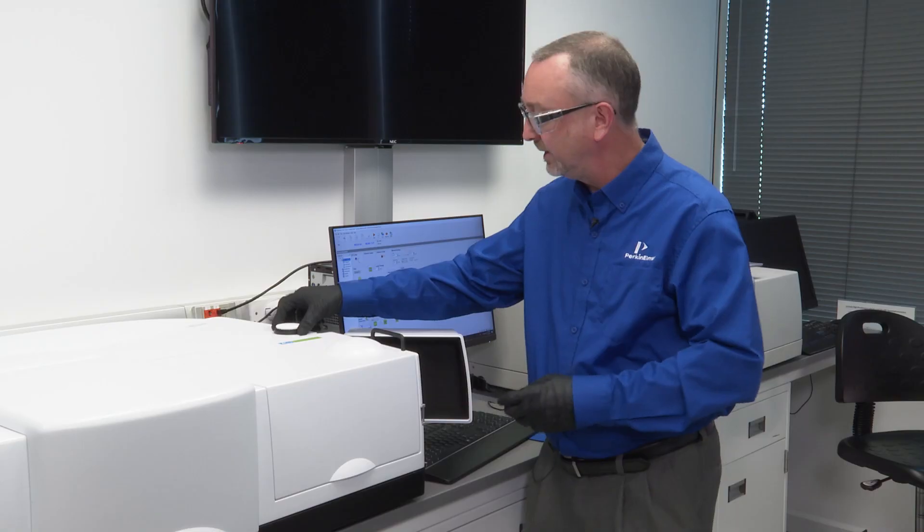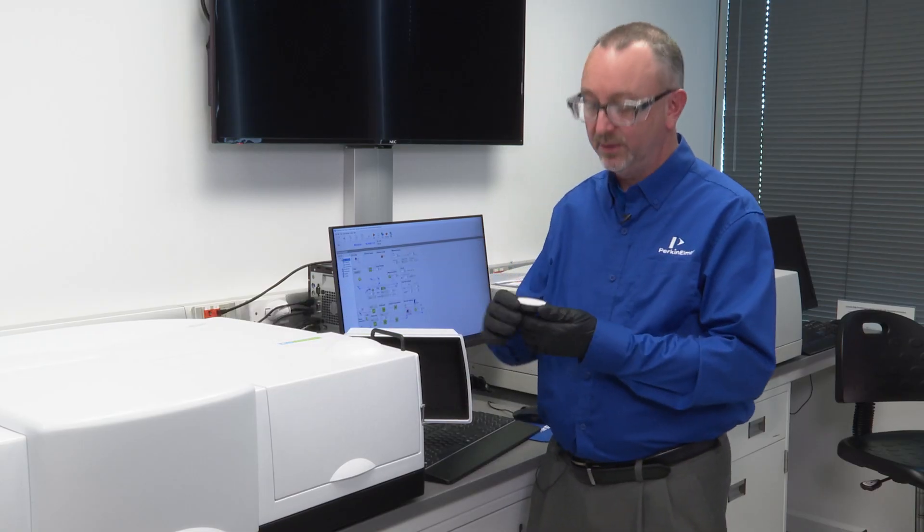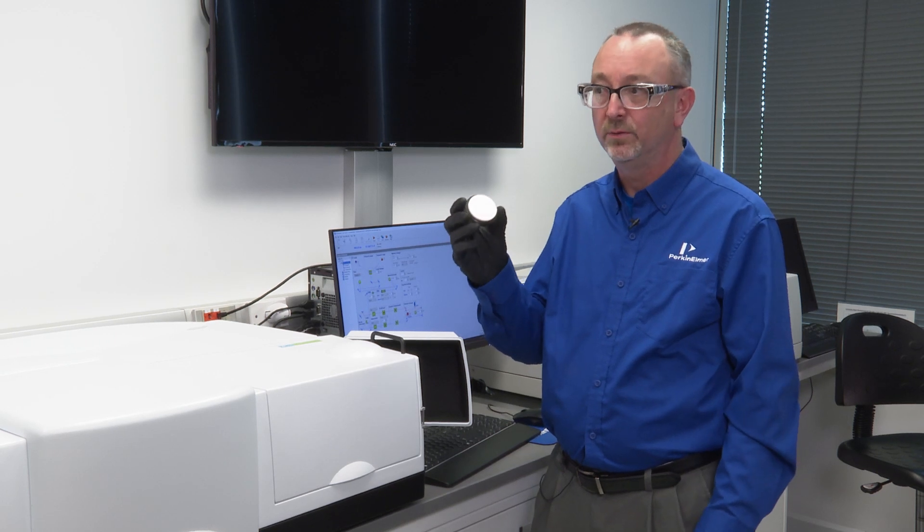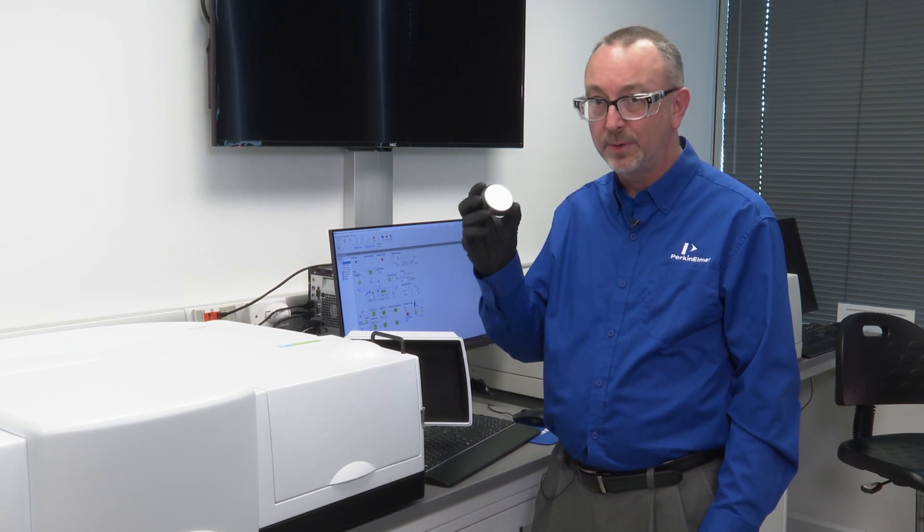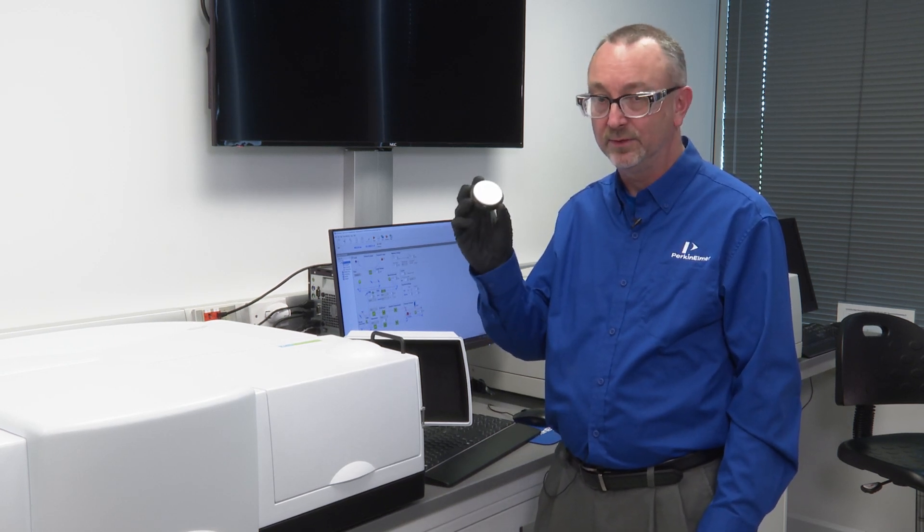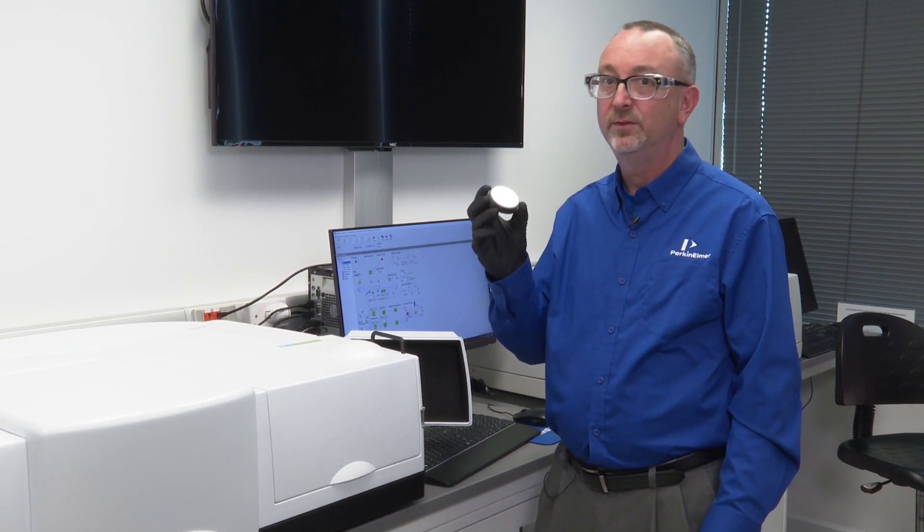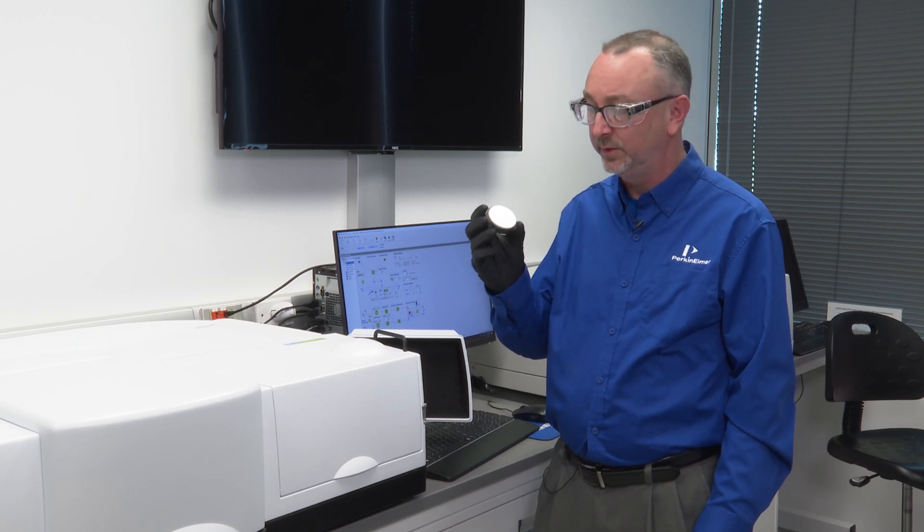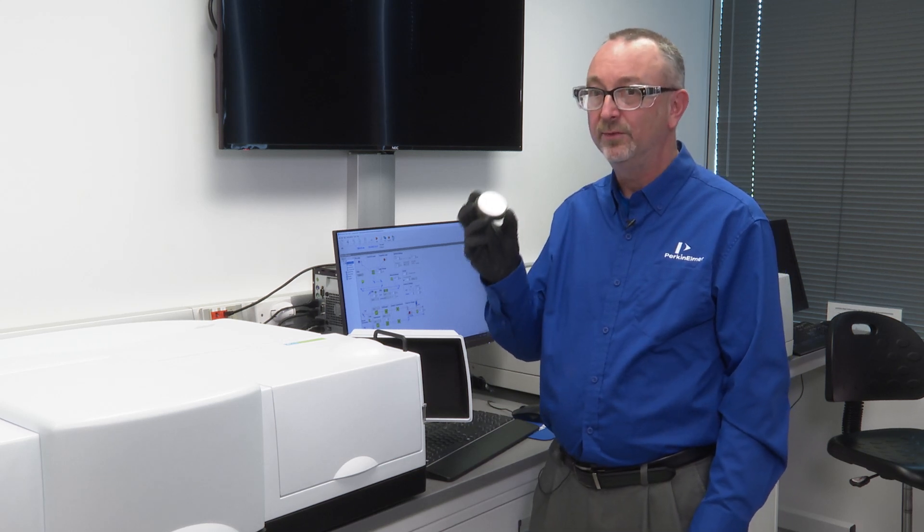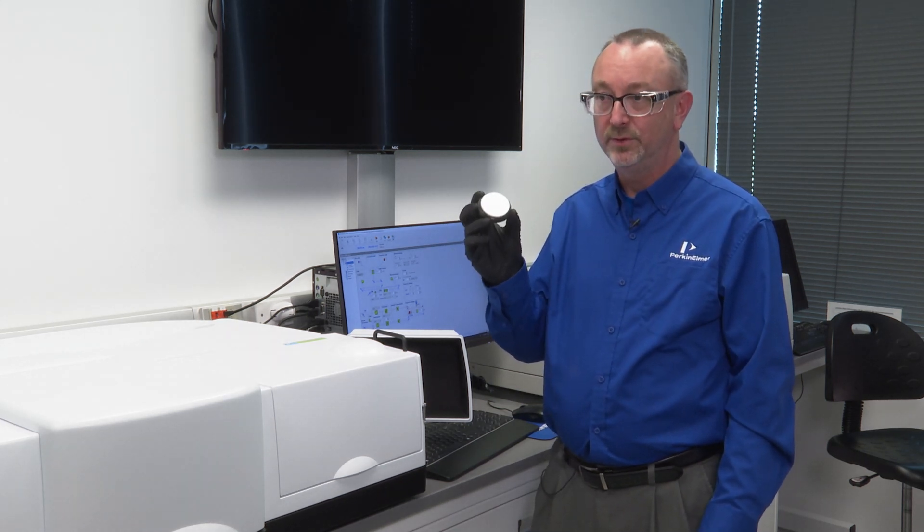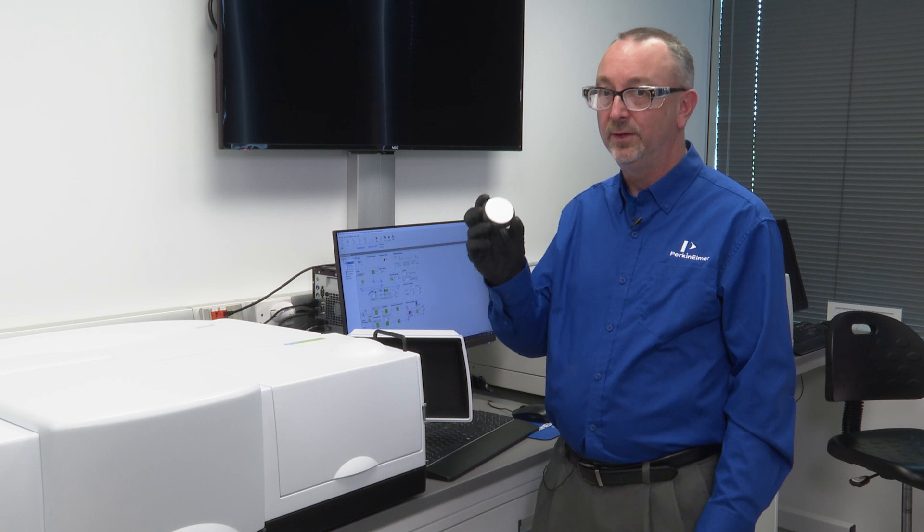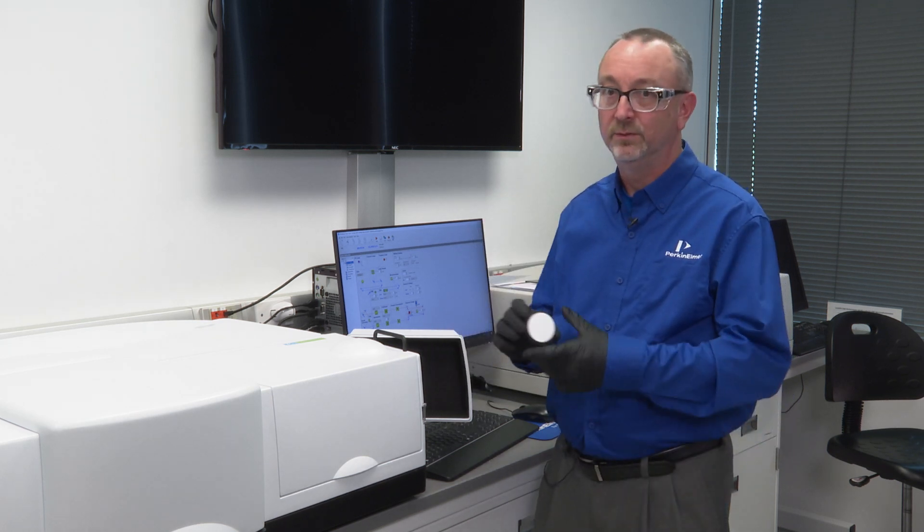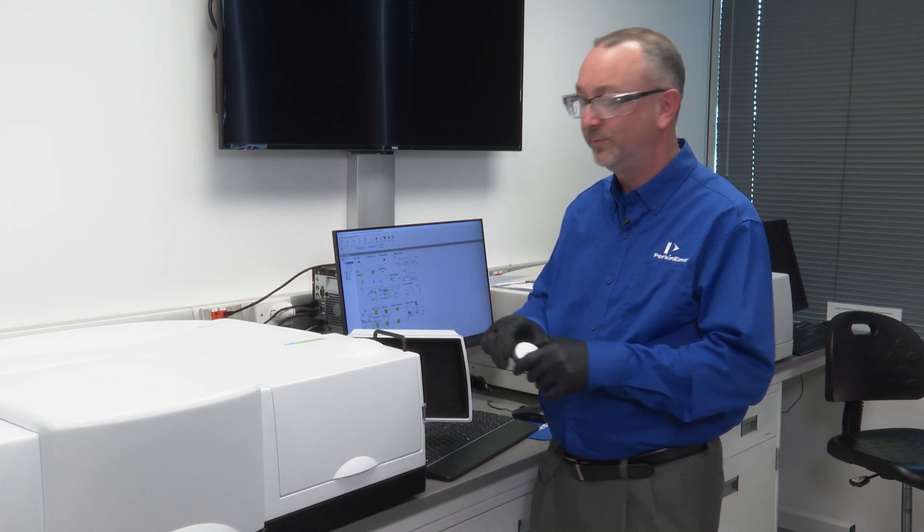I have previously collected a correction file with my Spectralon puck, the reflectance puck. This is a calibrated known material. We must know the value of this material to then compare that with the unknown. This is a relative measurement.